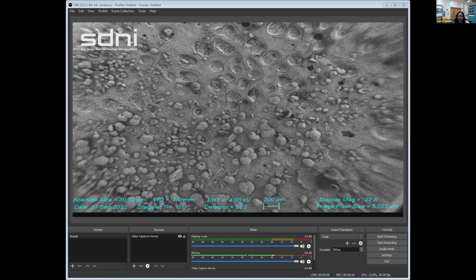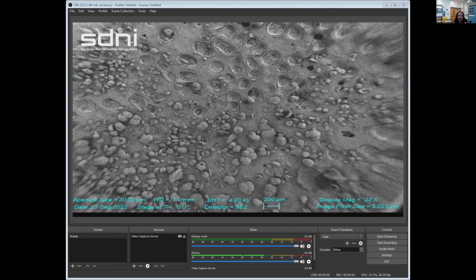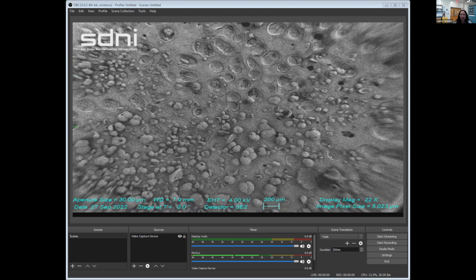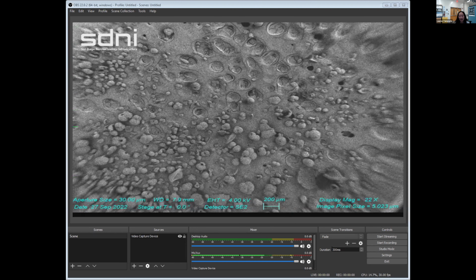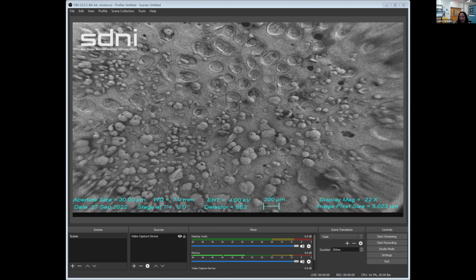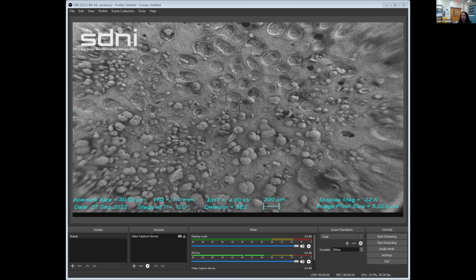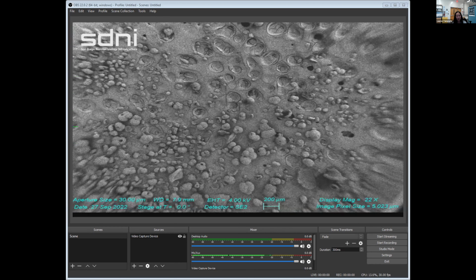So these are radiolarians. So it comprises some zooplankton from the seas of La Jolla, which are right next to UCSD. And they're actually samples donated by the Scripps Institute of Oceanography, which is part of UCSD, but is the part of UCSD that's actually right next to the ocean and the dock. So they have lots of samples that they can get from there, and hopefully we can get more. But radiolarians are protozoa, or single-celled organisms that absorb silica from seawater to produce intricate mineral skeletons, which we will see as we go closer.